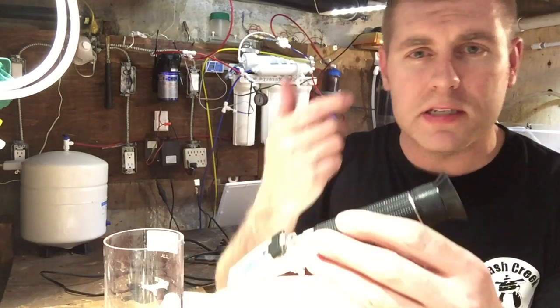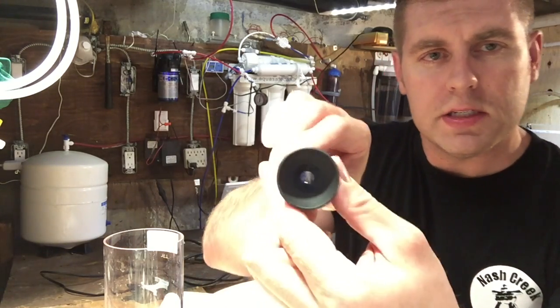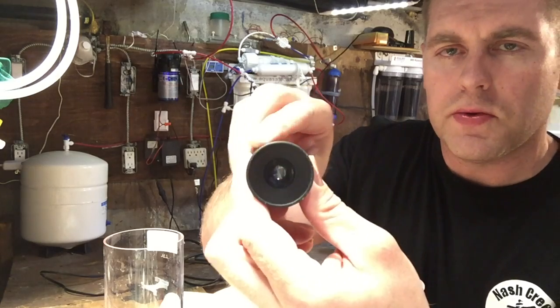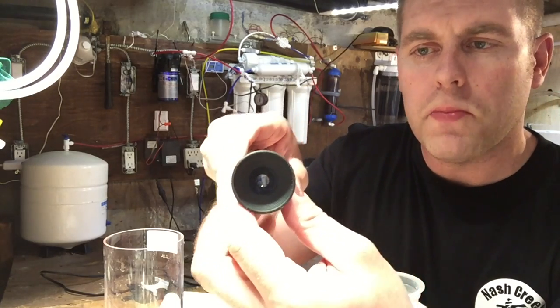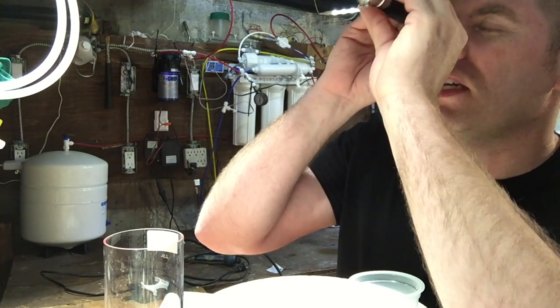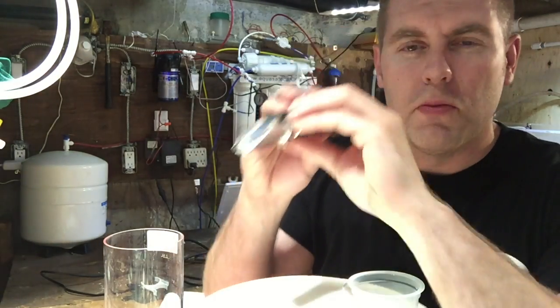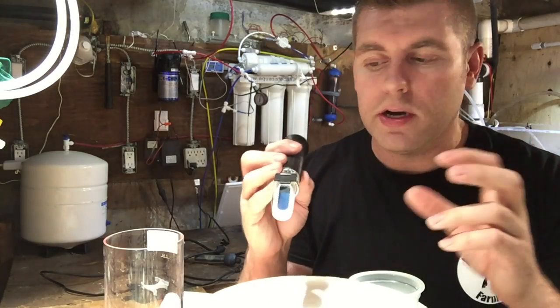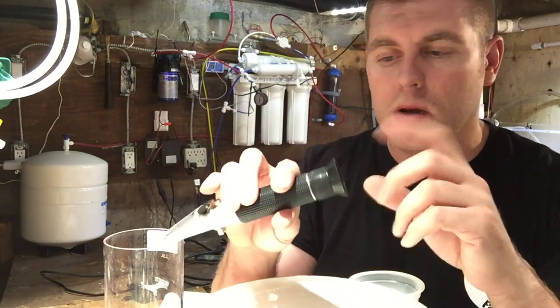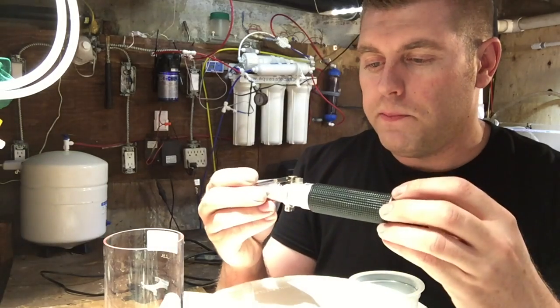Another tip: if you wear glasses or contacts like I do, there's a focus lens right at the eyepiece. It's just like looking through a telescope or binoculars — you want to adjust it to your eye to get a clear result. It can get blurry, so make sure you get it in focus for your eye.